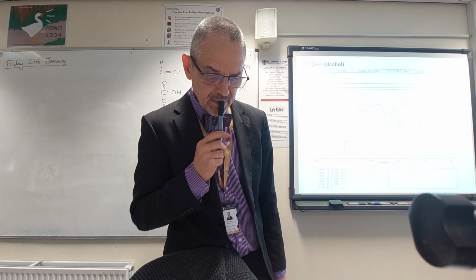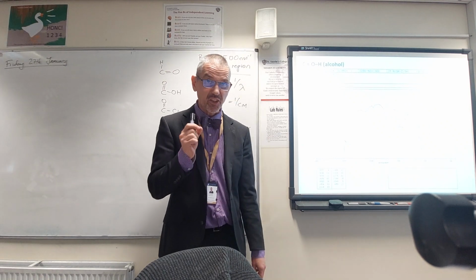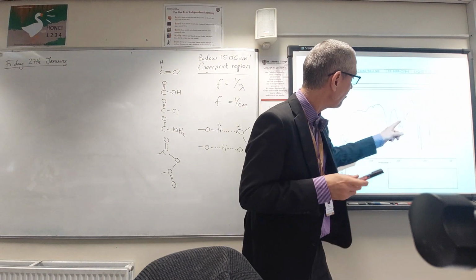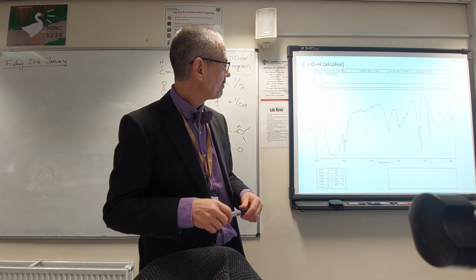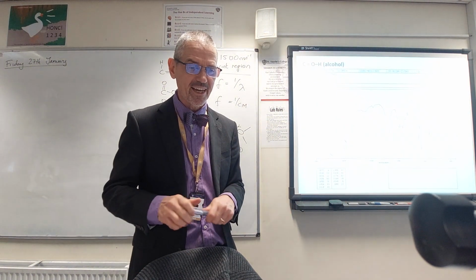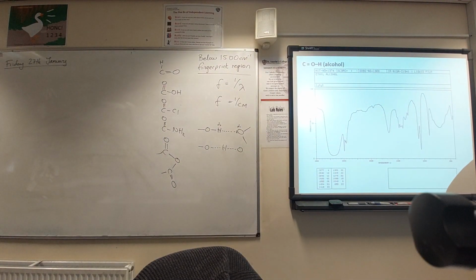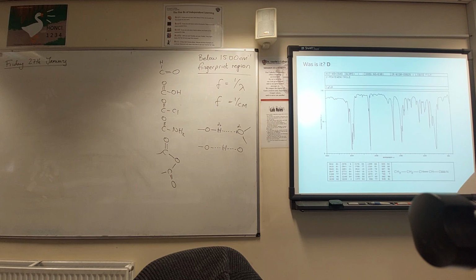Yeah, but again, carbon-carbon double bonds are small and sharp, and it's not quite big enough to be a carbonyl. I find that a little bit confusing. But hopefully the examples they give you in the exam won't have random peaks on, which are confusing. I might even edit that out. No, I'm not going to do that. One more.